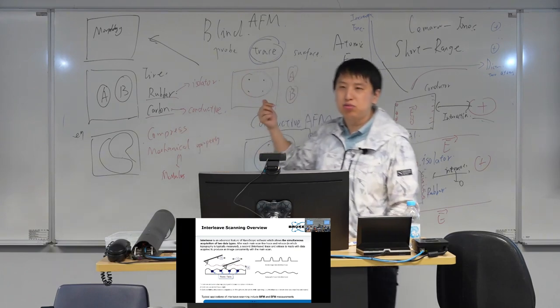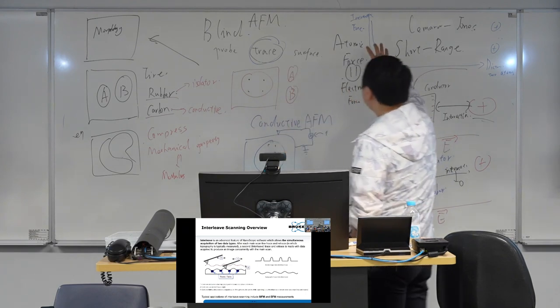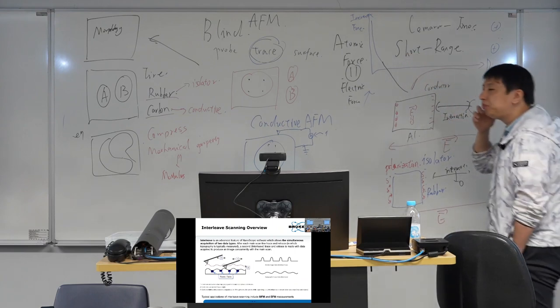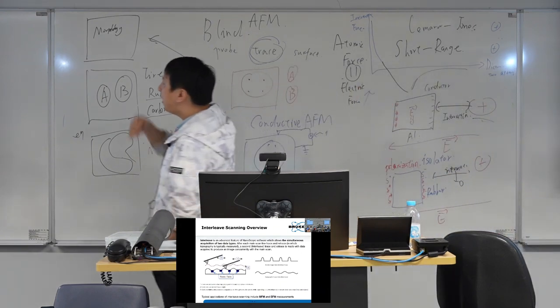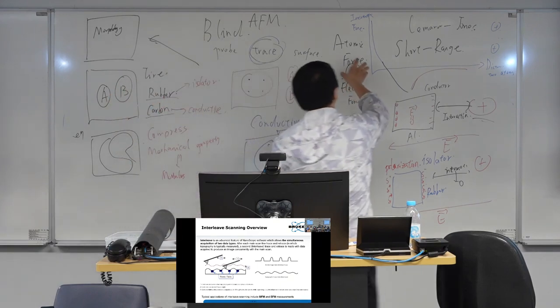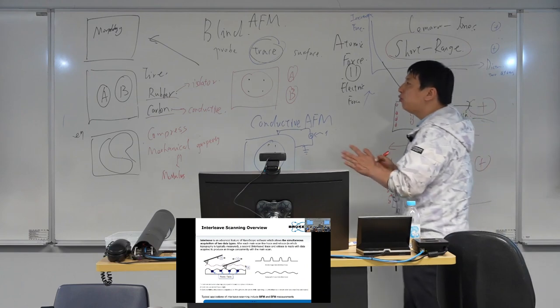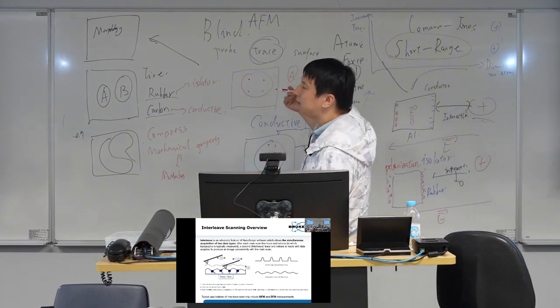It can measure the atomic force, and it can measure the interaction force between different charges. So how can we distinguish them? We find a typical property of the atomic force: the atomic force is short range. If we want to measure another force, we will use this property.